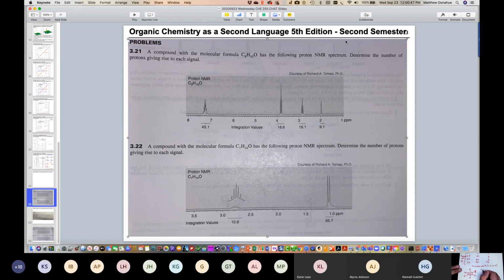So we started with C8H10O, which had 4 degrees of unsaturation. This fragment has C6H5 with 4 degrees of unsaturation, so that gets us C2H5O with no degrees of unsaturation. So how do you bond these elements together with no degrees of unsaturation, attach it to here so that you account for these remaining unique sets?